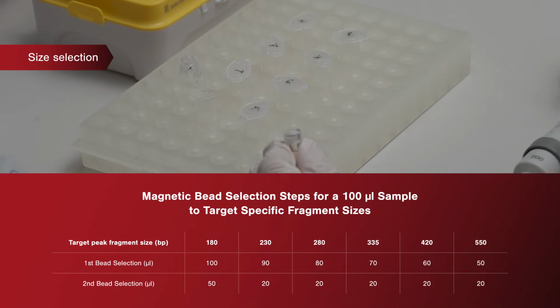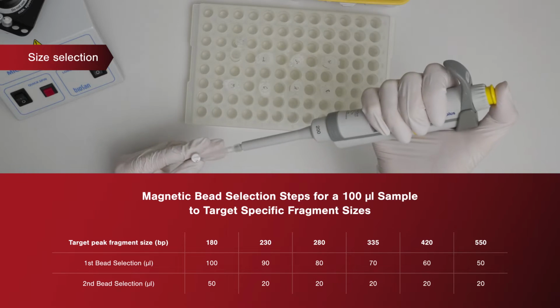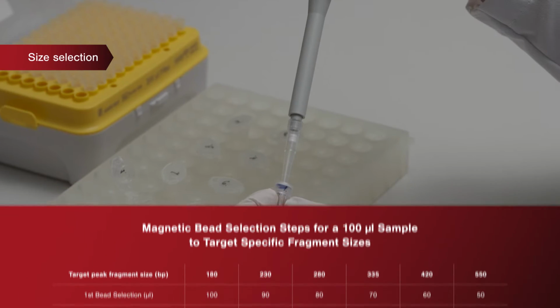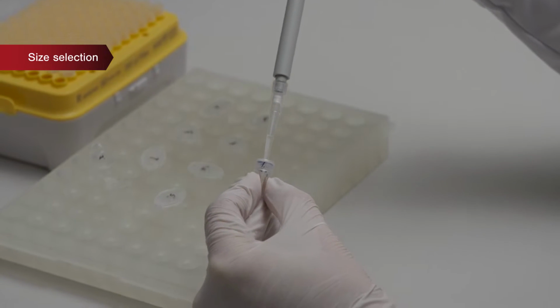Smaller fragments are retained in the buffer and usually discarded. Please keep in mind that magnetic beads must be stored at room temperature for at least 30 minutes and carefully suspended before use.